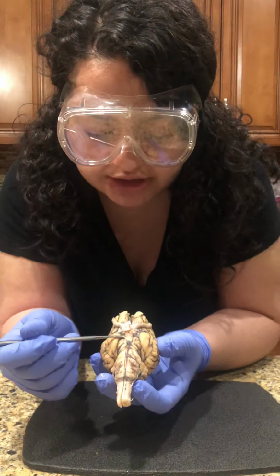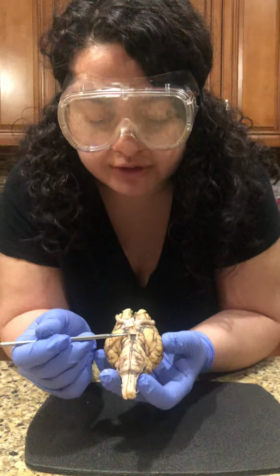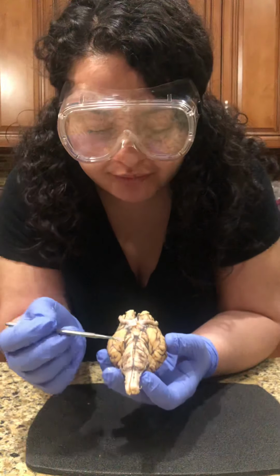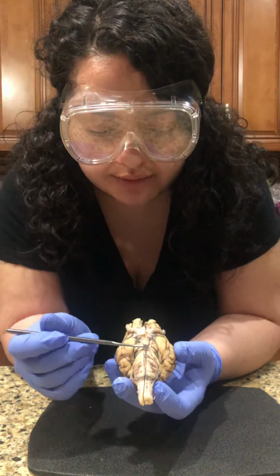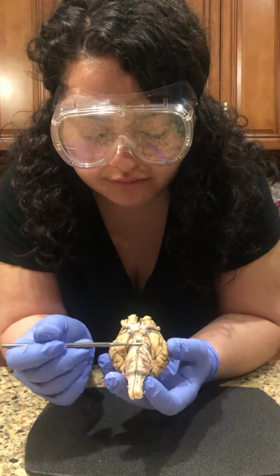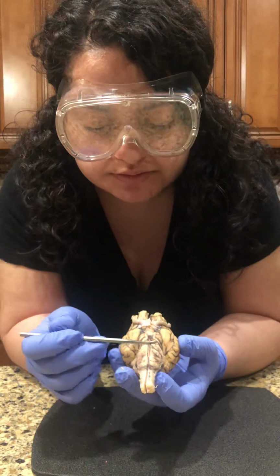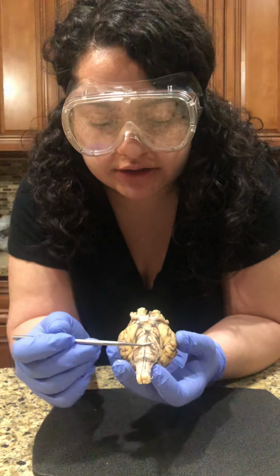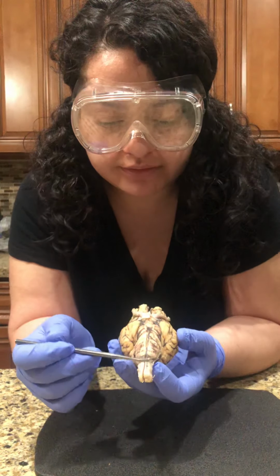And with this sheep brain, you can actually expose more nerves. I looked it up and they're called the oculomotor nerves, so they help with the movement of the eyes. So that's cool to know. And if we go a little more down, this portion right here is the midbrain. Further down, right here is the pons. And if I keep going down, right here is the medulla oblongata. And then it'll reach out to the brain stem.